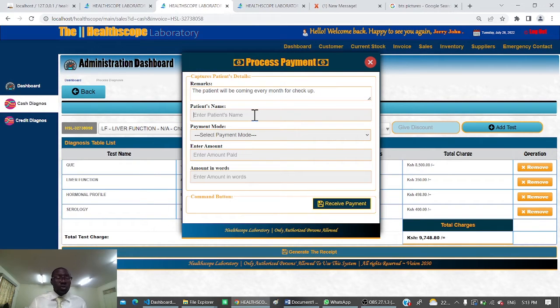So here what you need to do, for example, if the patient is Mohammed Juma, you just enter the first letter, and the system will automatically display that for you. You have maybe people like Angeline Gitili, you have Ali Mohammed Moha, but we want to use, let me check this one.